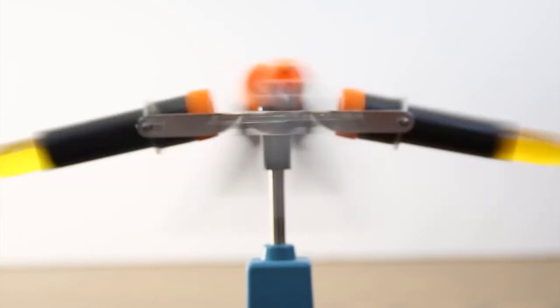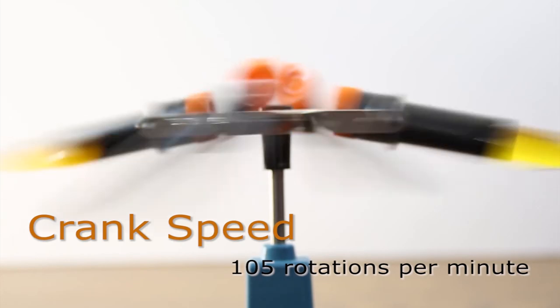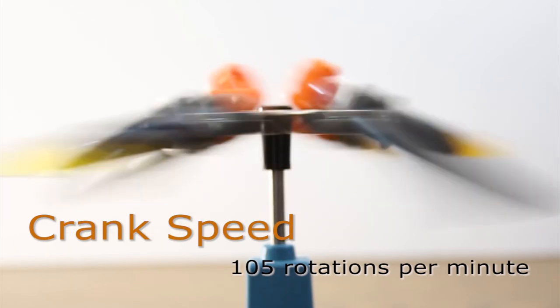To obtain a proper relative centrifugal force, the centrifuge must be cranked at 105 turns per minute to achieve a tube revolution per minute of 1,692.